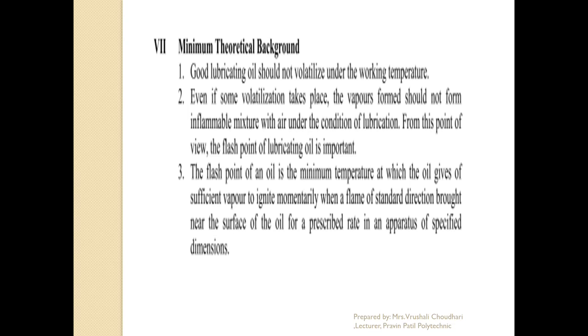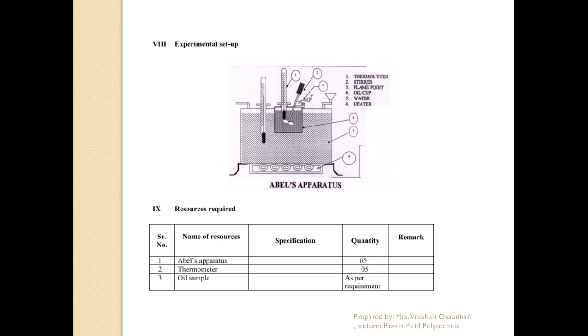We are going to perform the experiment such as experiment number 14. Here also we are using the heater as well as the thermometer for increasing and maintaining the temperature. This is more precise because we cannot take the temperature above 49 degrees Celsius, and in this apparatus we are using highly volatile samples, so we have to perform this experiment very carefully.